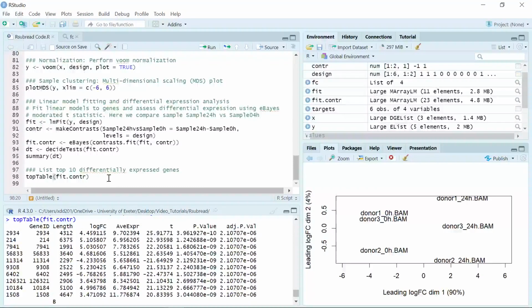Okay, so I'm going to finish this demonstration. This video tutorial takes a long time to run, but I will cut off the running time for the mapping process. So if you have sequencing data and you want to use Rsubread to do the analysis, I will post my code in the comments under the video. Then you can use the code and just change the sequencing dataset name to your dataset. Then you can run the analysis.